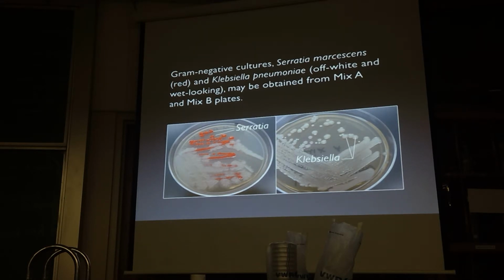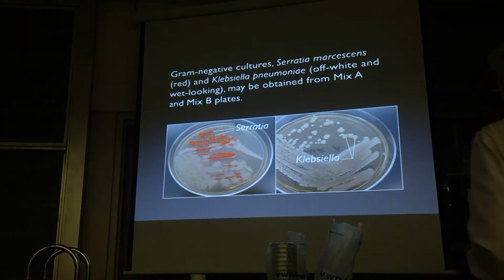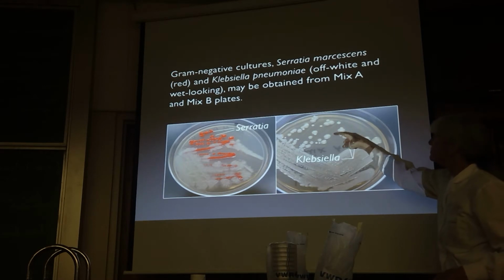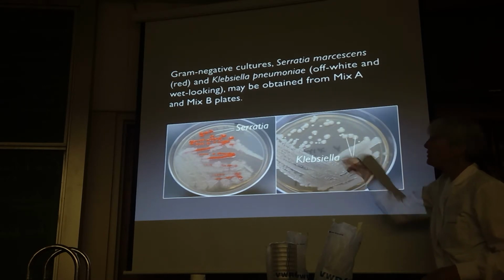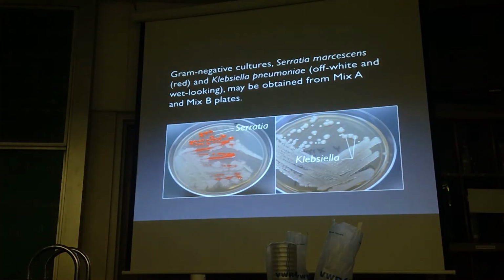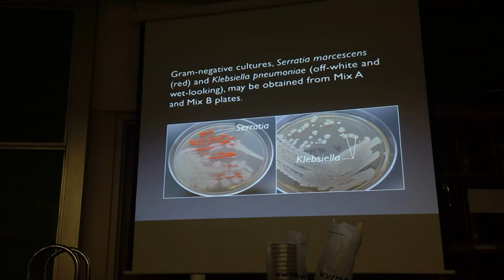If you use those old Bacillus cultures, the gram stain quality won't be good. Klebsiella, again, the Klebsiella colonies are the big slimy looking ones on the Mix A plate. Big slimy Klebsiella. The little white ones are Staph, but don't use the Staph off your Mix A plate. Use the Staph from the slants, because these are younger cultures.